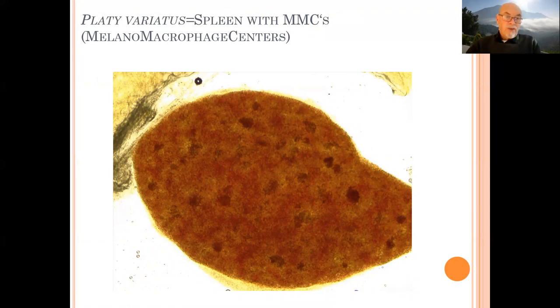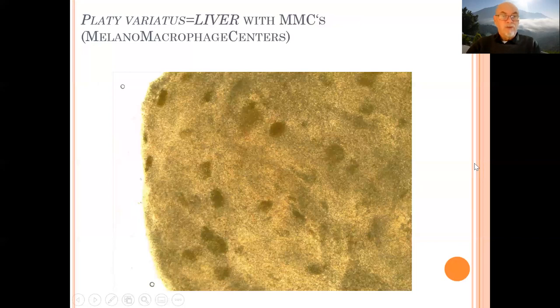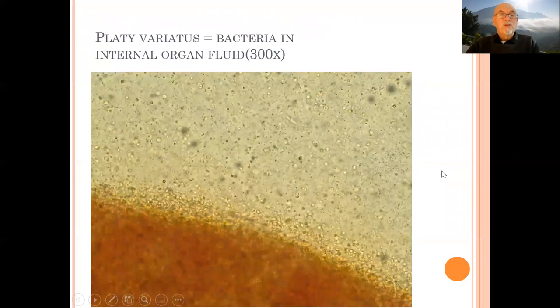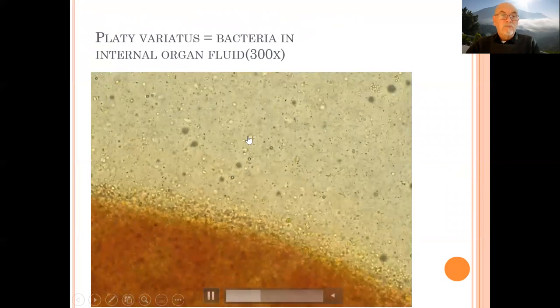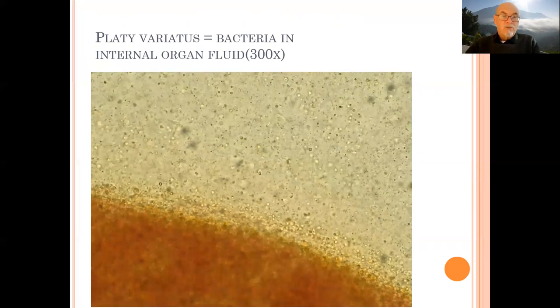At the same time, we found in the organs melanomacrophagic centers. This is a reaction usually due to a bacterial infection, and it affects the organ — those big dark areas are taking away healthy organ tissue. Also in the liver, the same problem. The organs are infected. Also the kidney with black specks. This is all caused by bacteria, and here you see on the video millions of these tiny specks moving around, all over in the body of that platy.